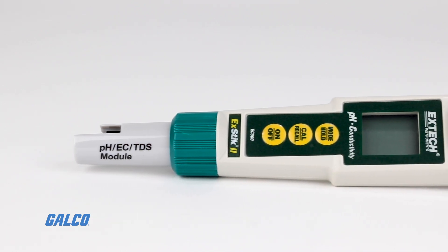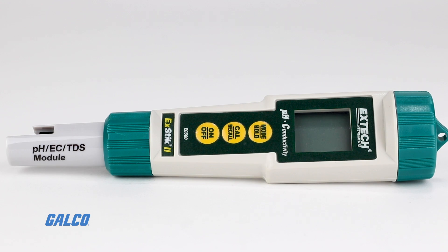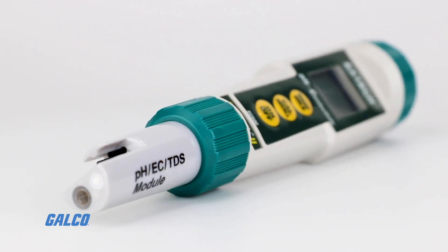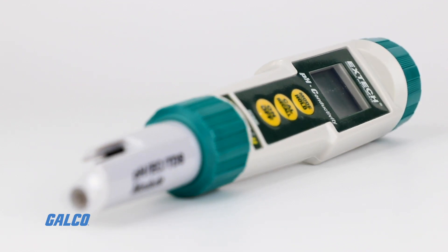EXTEC's EC500 waterproof EXTEC 2 pH conductivity meter is a combination flat surface pH electrode with a high-accuracy conductivity cell that can measure five different parameters.